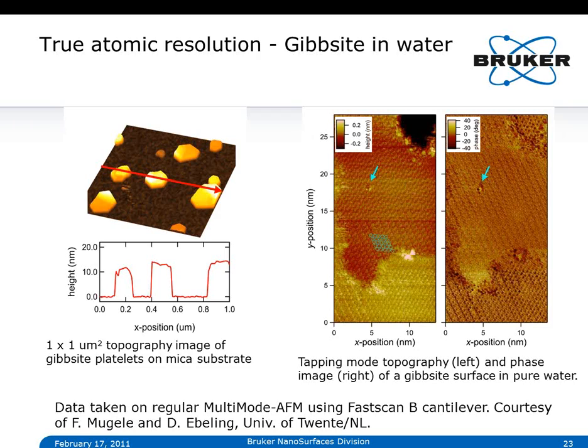What you can see in the image here is three different terraces. You can clearly distinguish the terraces. You can see the energy at the step is higher. That's why you see a bunch of particles adhere to the step edges.